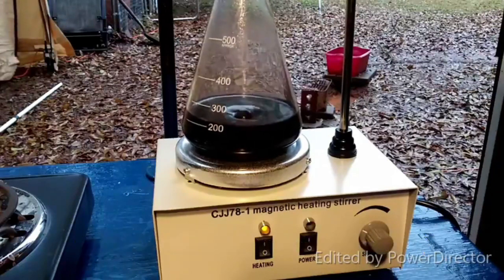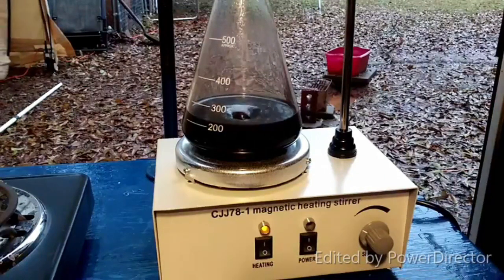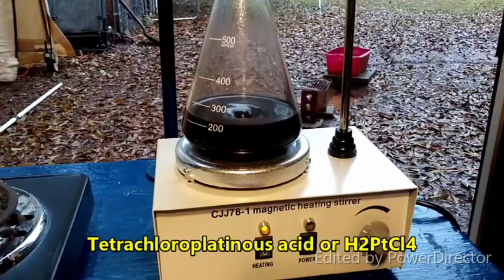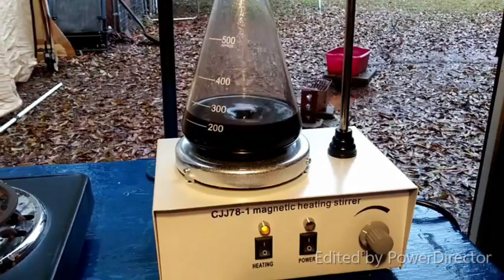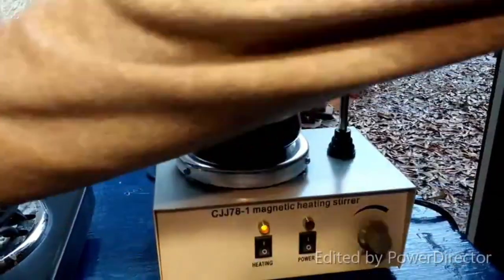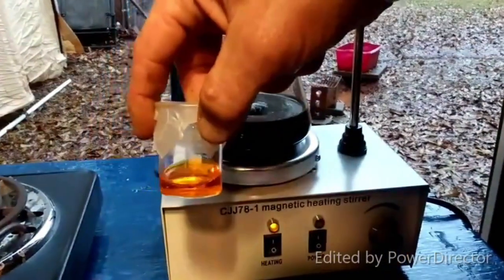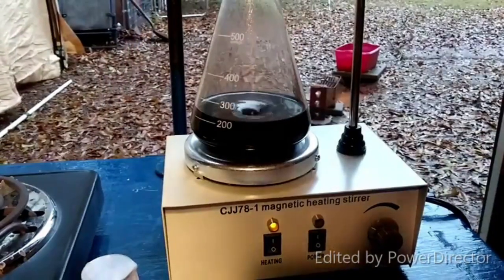what I did was I took 10 milliliters of the hexachloroplatinic acid solution and I tried to reduce it by bubbling sulfur dioxide through it. I was trying to produce tetrachloroplatinous acid. Obviously, that didn't work out. From what I read, it should have gone from our normal orangey solution here to a red-colored solution. That didn't happen. It turned yellow.